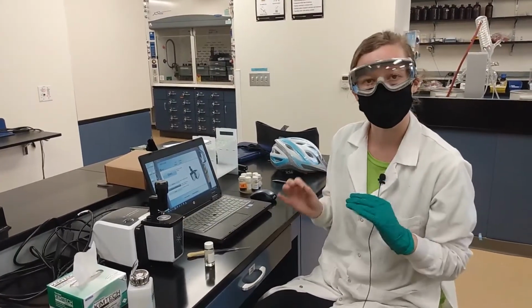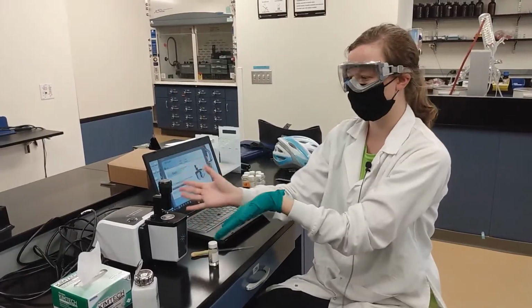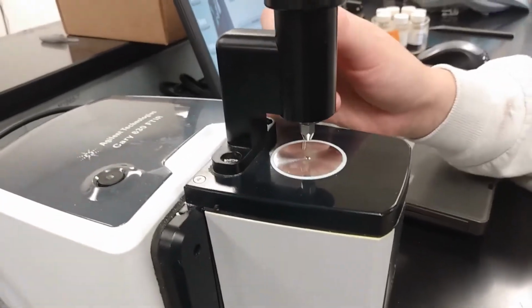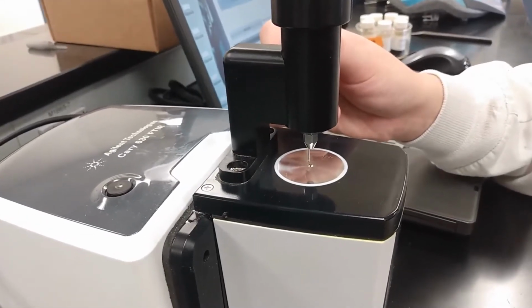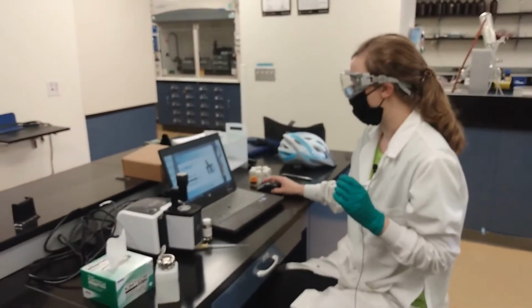Okay guys, so now I'm going to show you how to run an actual IR sample. So this is the IR machine. We've got these beautiful tiny instruments here. If you look really closely, you'll see there's a big silver circle under the arm. And inside of that big silver circle, we have a little tiny clear circle. The little tiny clear circle is actually the diamond, and that's what's going to be holding the sample. So we want to make sure that we're centering our sample on that little diamond and make sure it's completely covered.